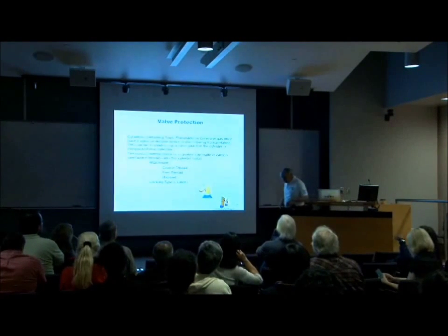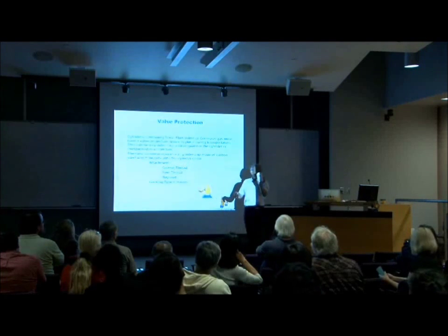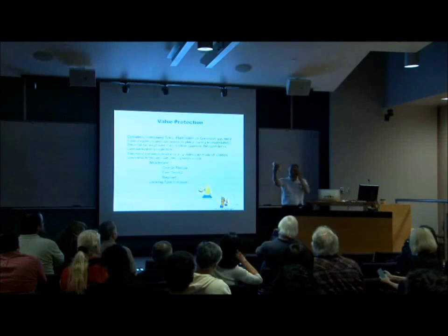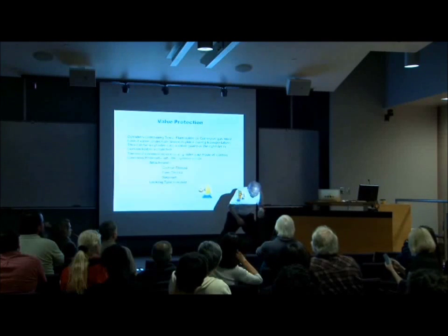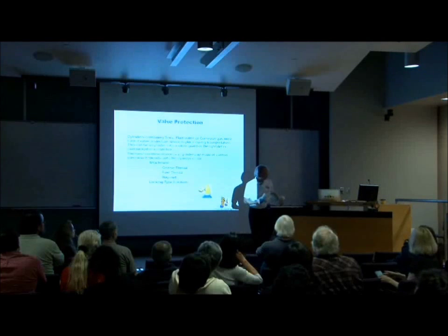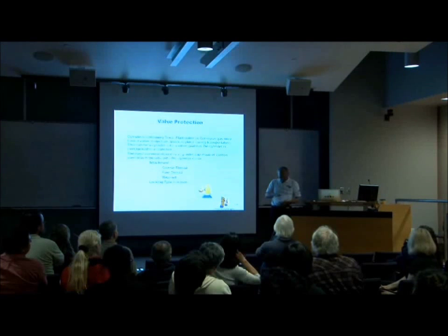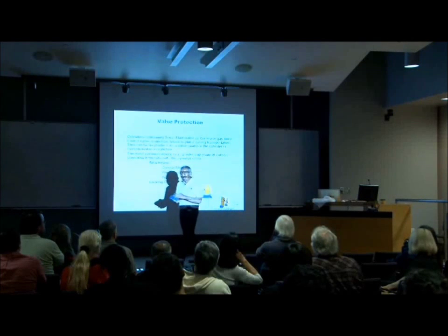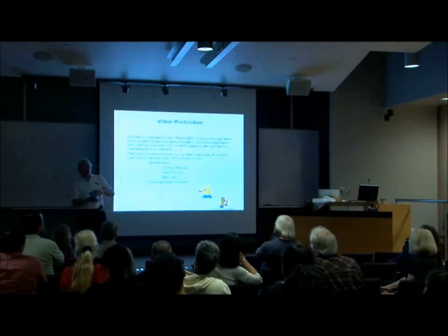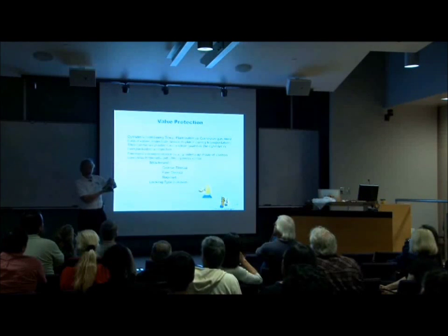Valve protection. The most common valve protection is the cylinder cap. Right, this is cylinder cap. It should always be on, except when you're using the cylinder, right? And now, why should you not pick up a cylinder by the cylinder cap? It's because many people think that the collar is an integral piece of the cylinder. It's not. The cylinder is made, and then the collar is put on afterwards. And look at the little ridge of metal that's actually holding that collar on.